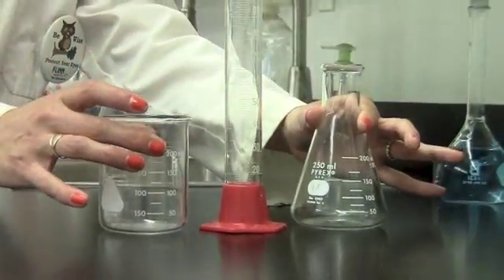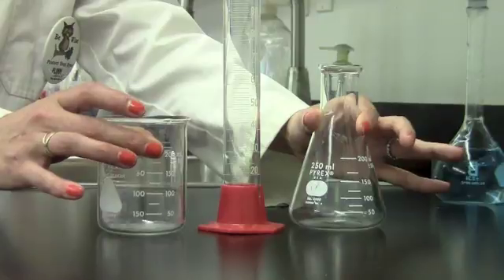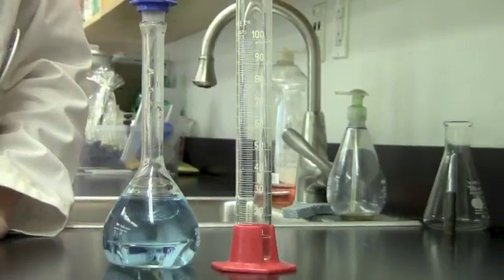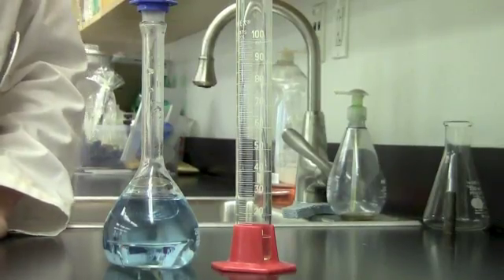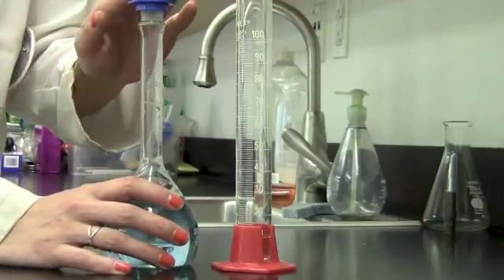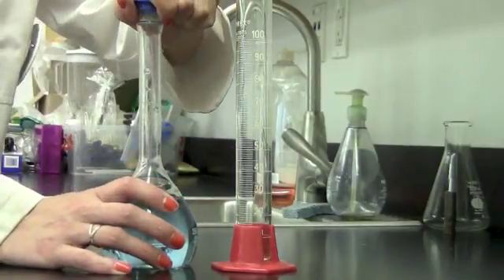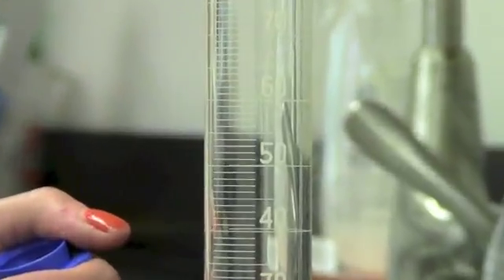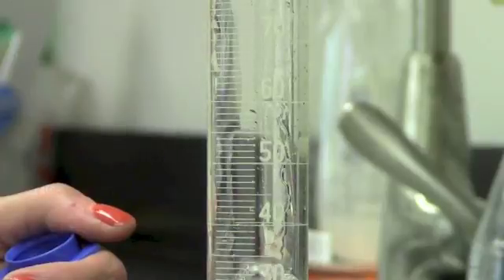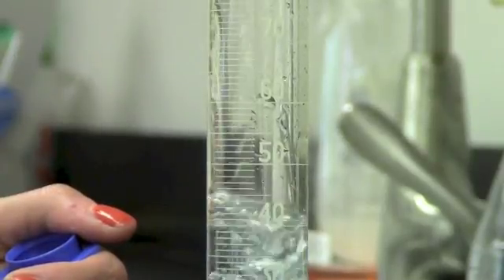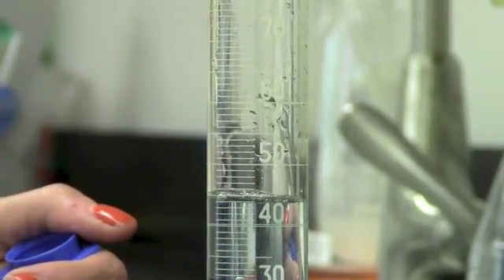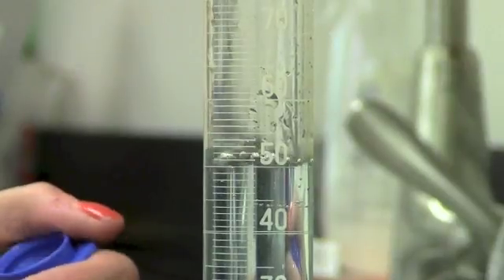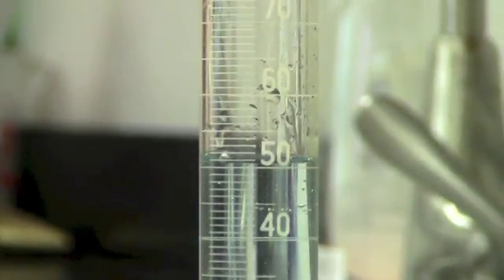Beakers and flasks are only to contain liquids we've already measured. Our lab procedure tells us to measure out 50 milliliters of copper chloride solution. So here's my stock bottle of copper chloride solution. I'm going to take the lid off. I'm going to carefully pour until I'm at about the 50 milliliter mark. You can pour a little more quickly at first and then slow down as you get close. I'm going to now put the lid back on my stock bottle.